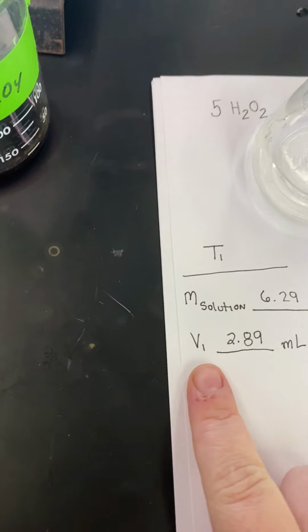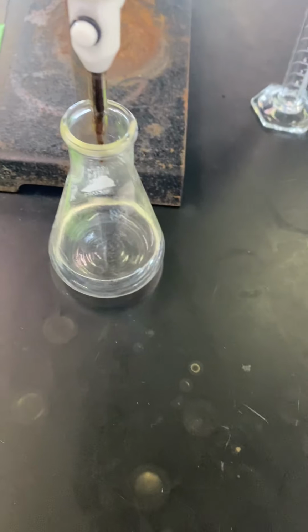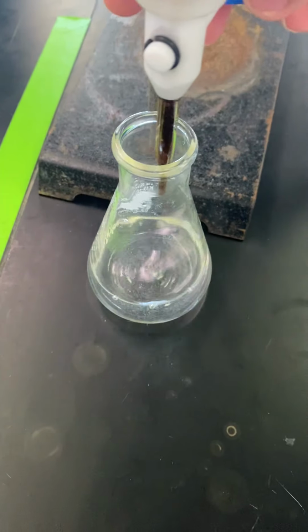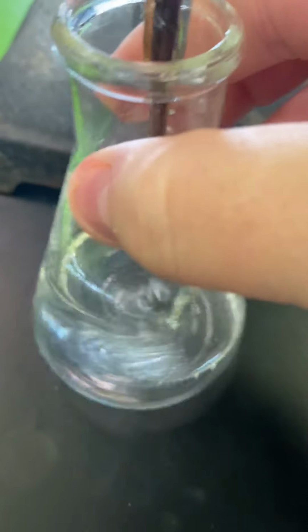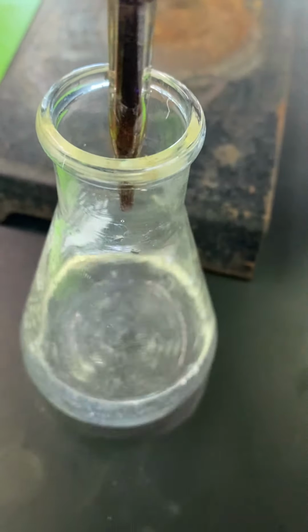Now we are ready to go ahead and start adding that purple permanganate to our hydrogen peroxide solution. Since this is my first trial, I'm going to go really quickly, and you can hopefully see very clearly what's happening as soon as that purple permanganate hits the flask. You can see the purple color vanishes immediately.